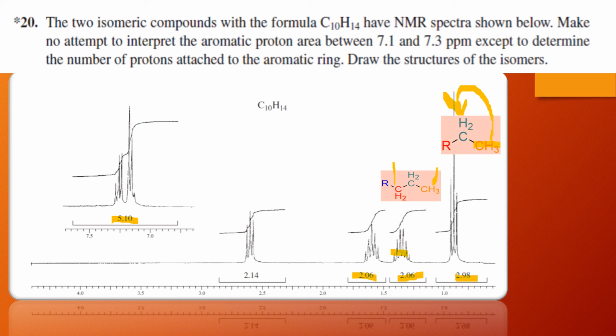And this peak is basically a quintet. There are 5 lines, right? So let's see.